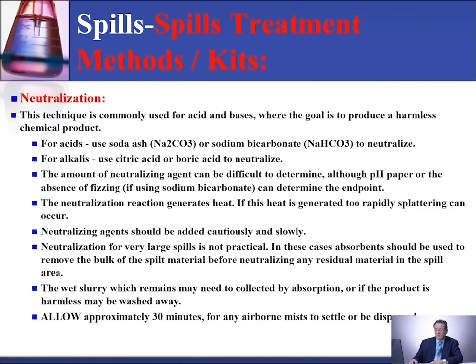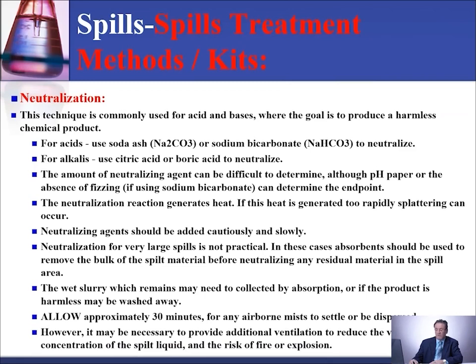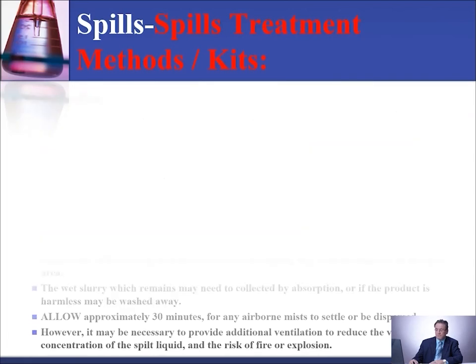Allow approximately 30 minutes for any airborne mist to settle or to be dispersed. However, it may be necessary to provide additional ventilation to reduce the vapor concentration of the spilled liquid and the risk of fire or explosion.